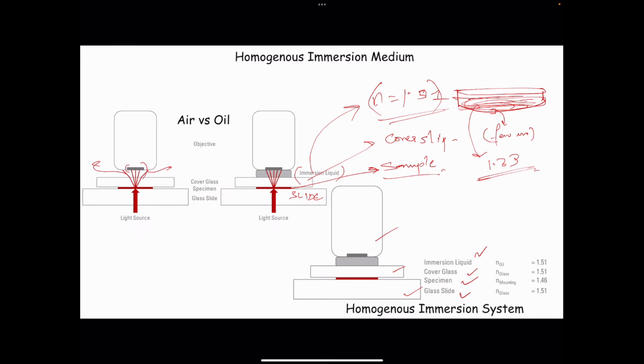Now, one of the problems in light microscopy is to overcome some of the limits of the optical resolution and to increase the numerical aperture of the system. That's what we are dealing with, right? It is very, very difficult to prepare high numerical aperture objectives. There are many corrections that have to be done to that objective, which increases the overall price, and availability of these objectives is a big trouble to us.